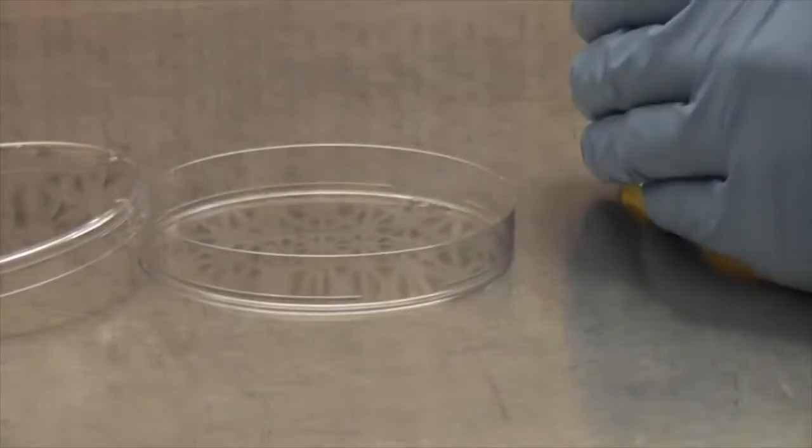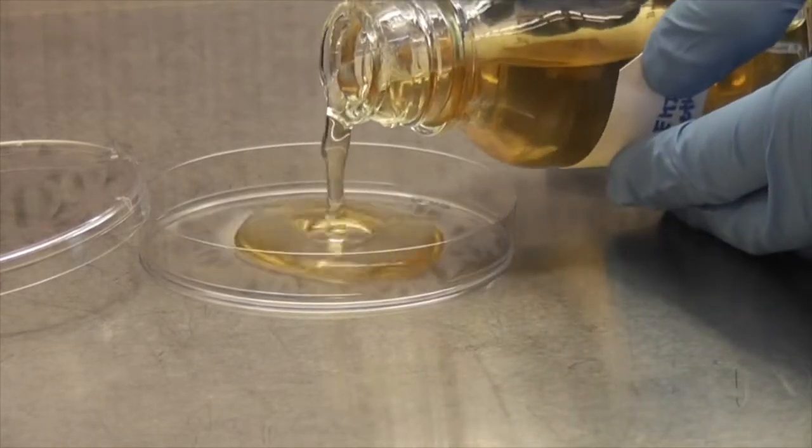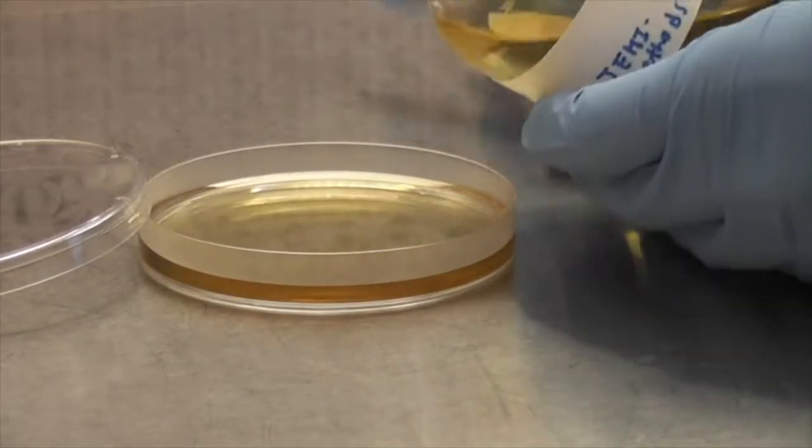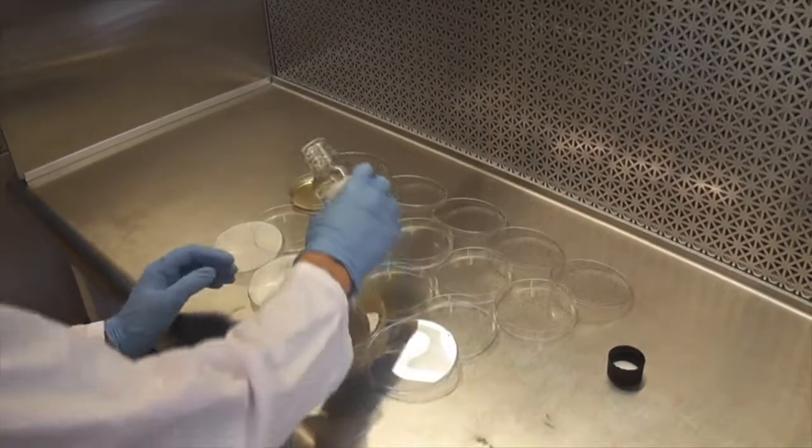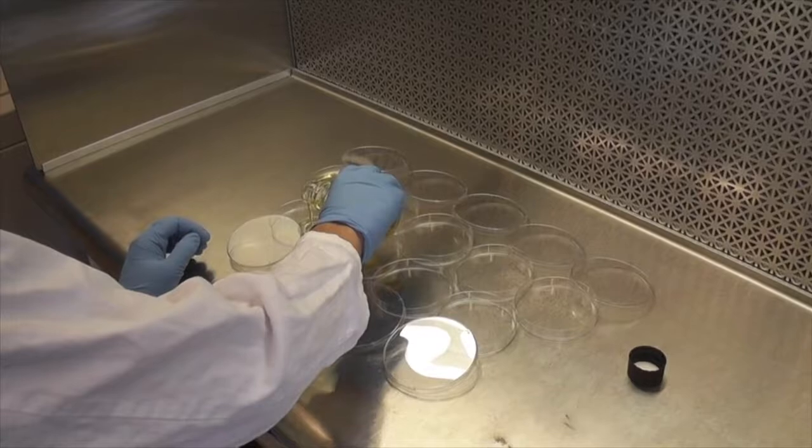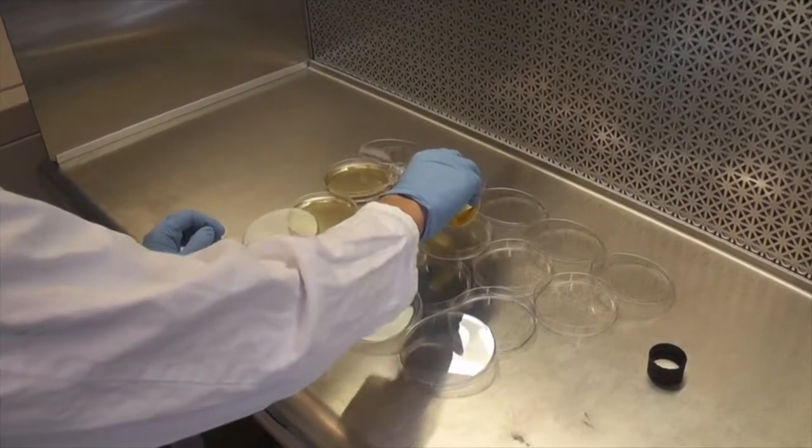Remove the lid from a sterile petri dish. Pour the agar in until it reaches halfway up the side of the petri dish. The volume per plate is roughly 25 milliliters. Continue pouring plates until all the agar has been used. Pour carefully to ensure that no bubbles appear in the agar.